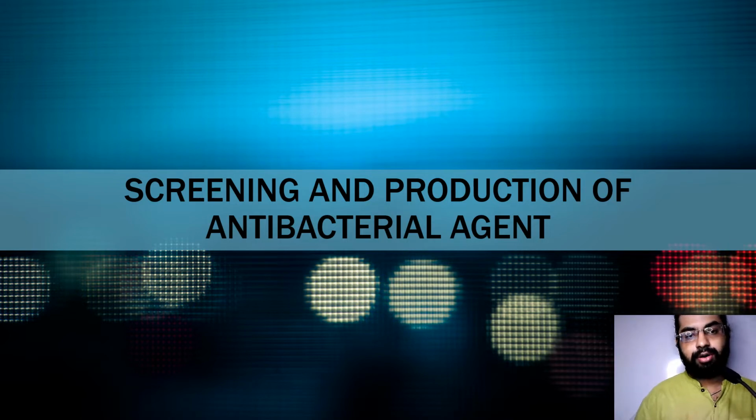So in this video I will talk about how we do screening of these microbes for antibacterial production, for this production of enzymes. Let's talk about this.